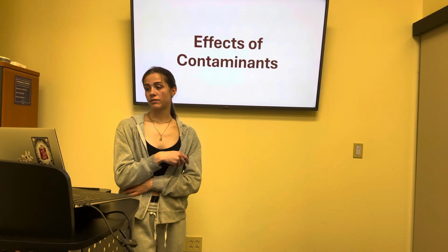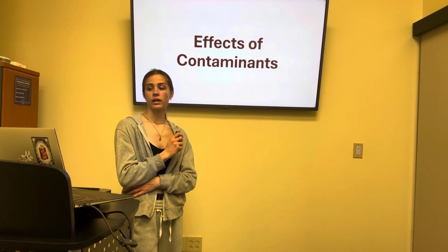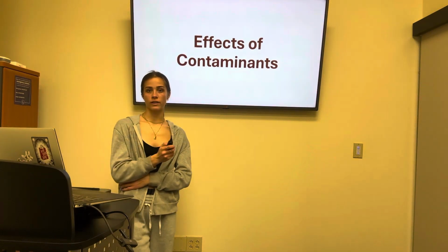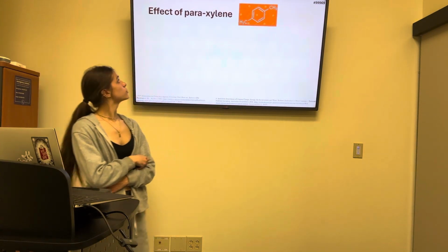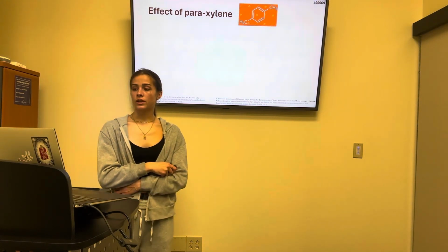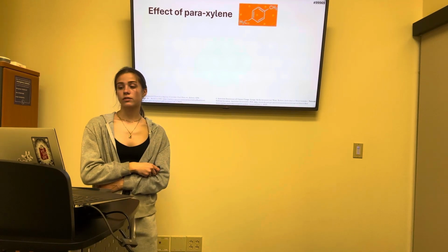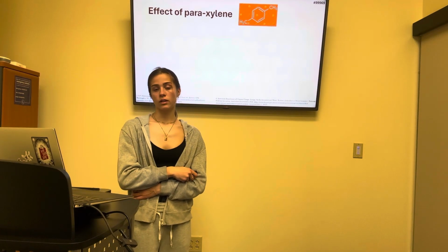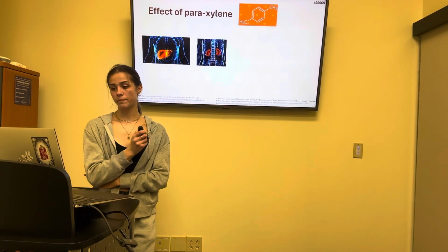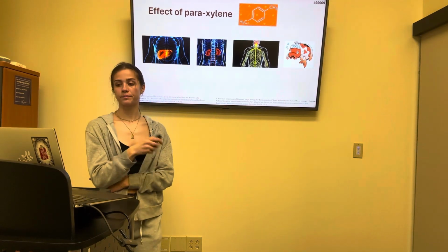So if the molecules discovered during this experiment are ever found in the drinking water supply, it can have many effects on human health depending on the one that was found. And besides just human health effects, there are many potential environmental effects as well. For this first sample, 99969, the presence of paraxylene in the water is a cause for concern and likely due to outside factors such as leaching from landfills, fuel spills, or industrial waste. Long-term health effects include damage to the liver, kidneys, and nervous system. And for the environment, aquatic life such as fish will experience high chronic toxicity.